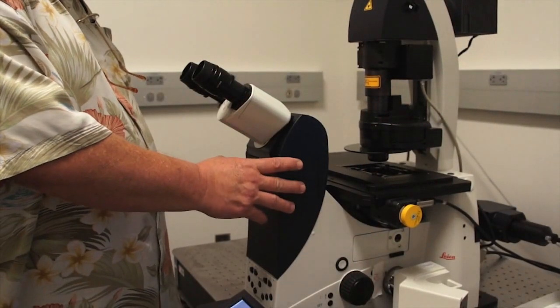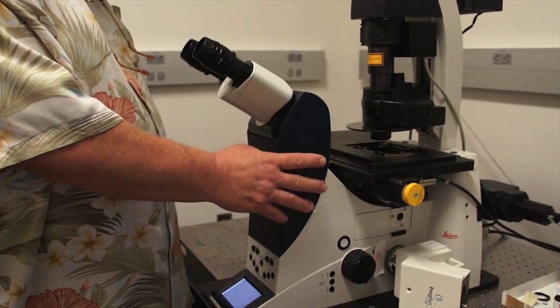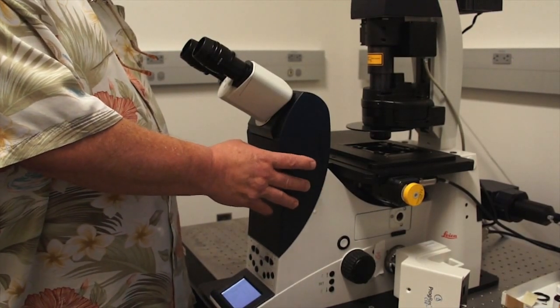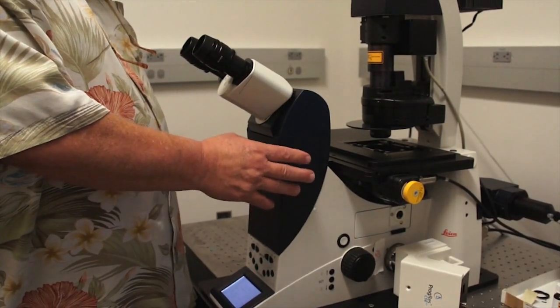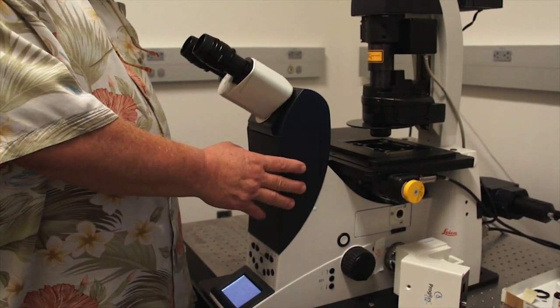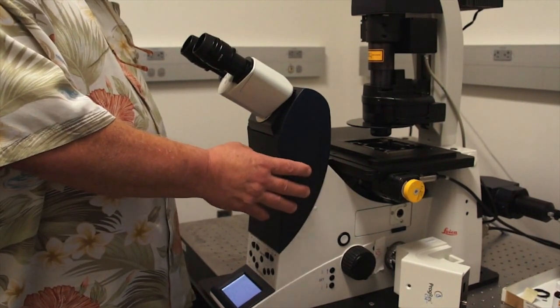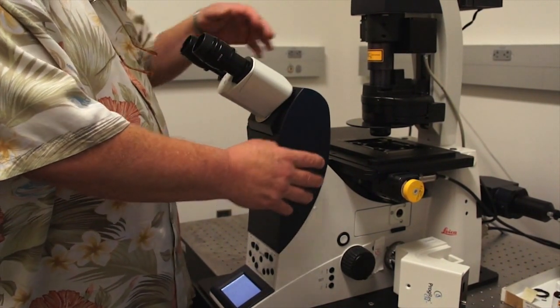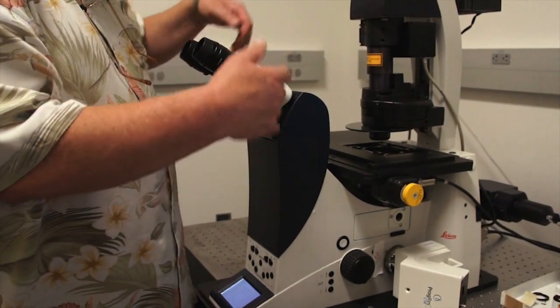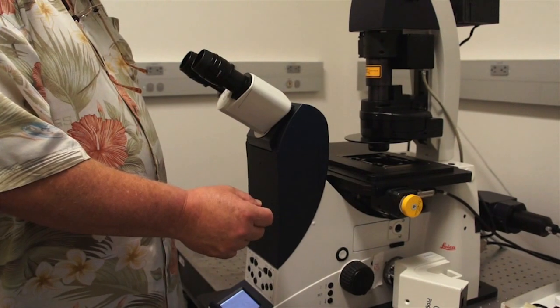The Leica confocal microscope has at its base an inverted microscope. Previously we discussed an upright compound microscope, and so we discussed the illumination path, we discussed the optical path, and here with an inverted microscope everything is reversed. Everything is upside down from the upright microscope that we worked with previously.